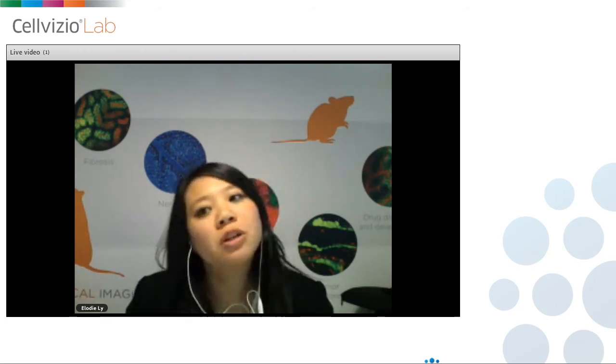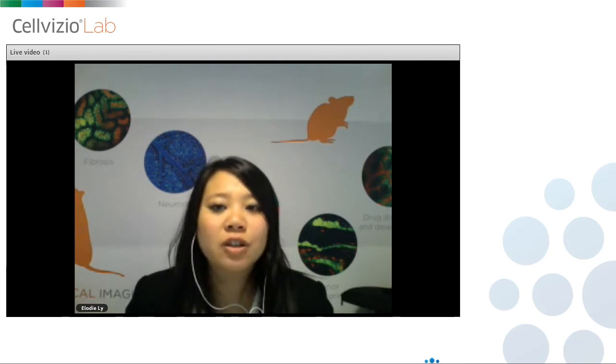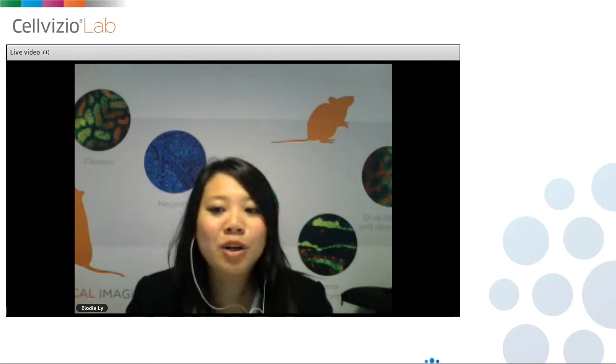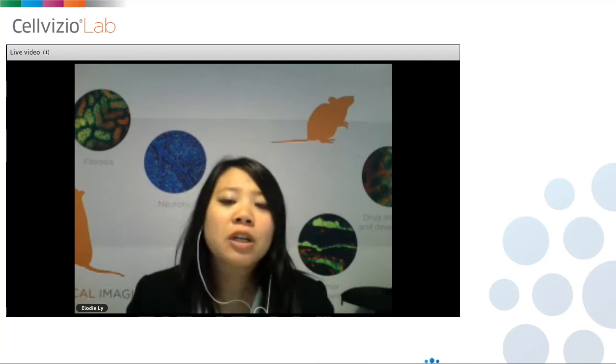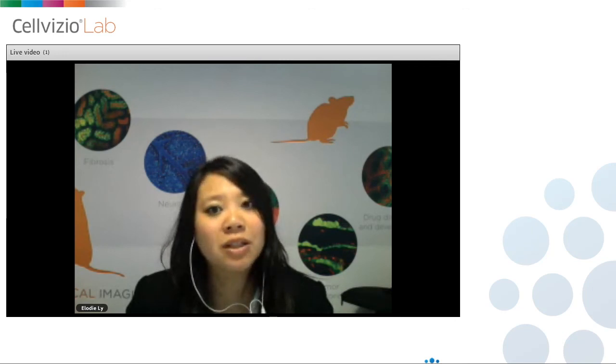One question regarding our confocal microprobes: if there is a specific probe that we can use to adjust for the Z movement. I guess it is whether we can change the confocal plane of our probe. In our configuration, the confocal plane is fixed. It means that you are not able to do Z-stacks, for example. What we will image is a single plane. It's a confocal plane, and it is fixed depending on the microprobes.